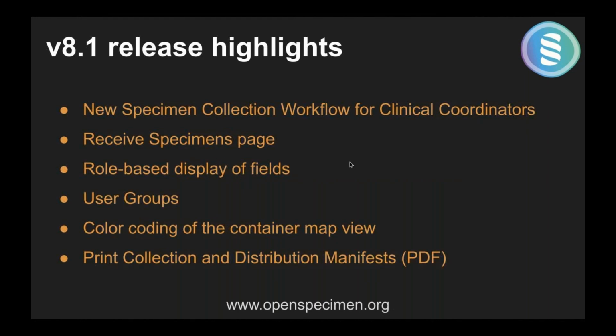So v8.1 is released, and these are some of the important new features. I'll be going through them one by one. One of the major enhancements is support for data entry by clinical coordinators. Right now, all roles pretty much work the same way, but clinic coordinators do a lot less work because they're just collecting the samples, not processing them.